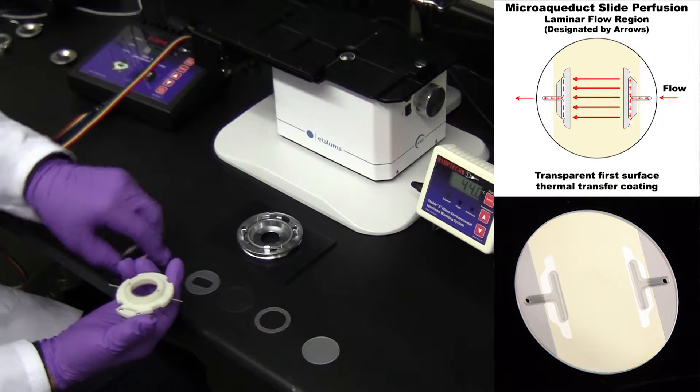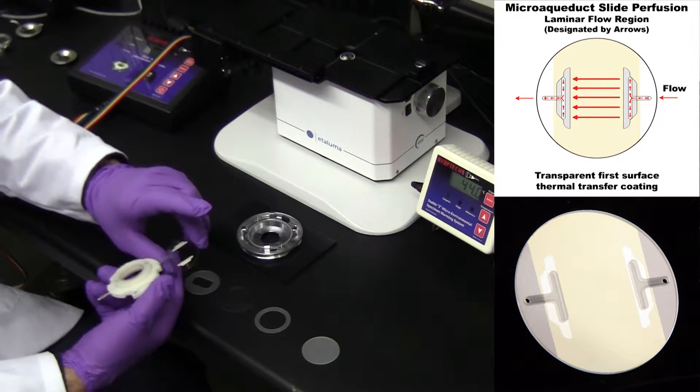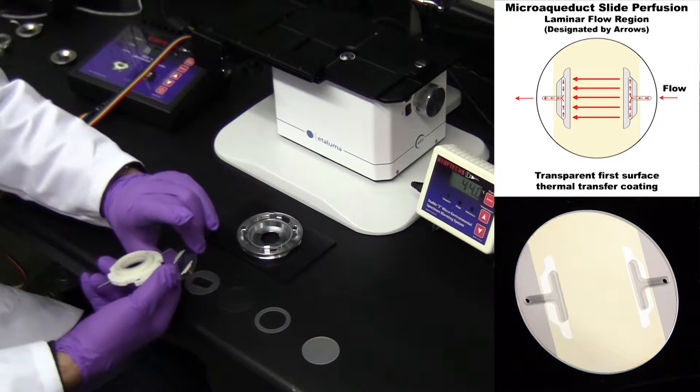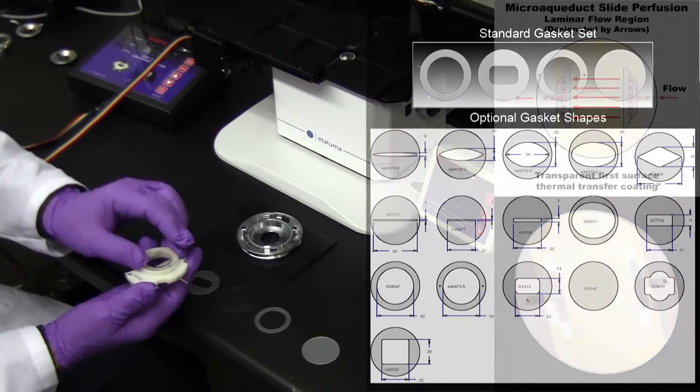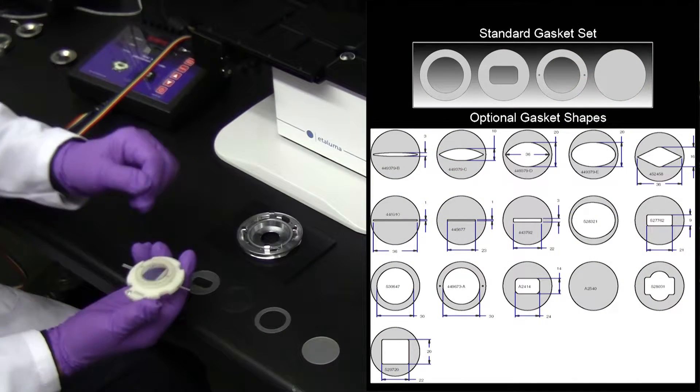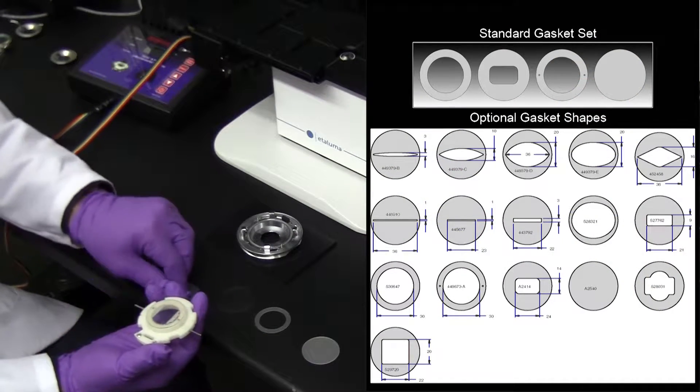The next component is a microfluidic slide, the heart of the FCS2. It is a combination of an optical surface, temperature control component, and microfluidic guide, having perfusion grooves to allow media to pass through the optical cavity.